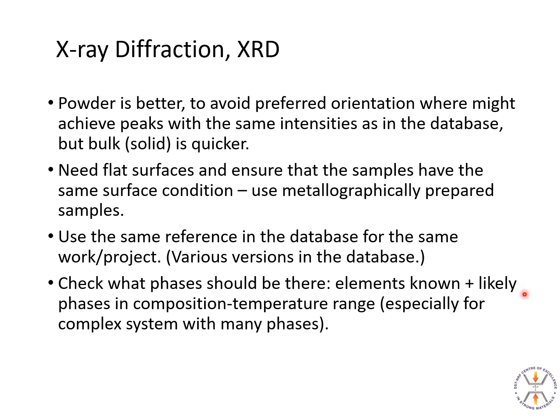If you don't, you do SEM EDX first, and you would know the composition and temperature range, especially for a complex system. So try and find out as much as you can. I usually do SEM first before XRD. I know a lot of people who are older than me would do XRD first because that's an older technique and they're more comfortable with that. But I prefer doing SEM.